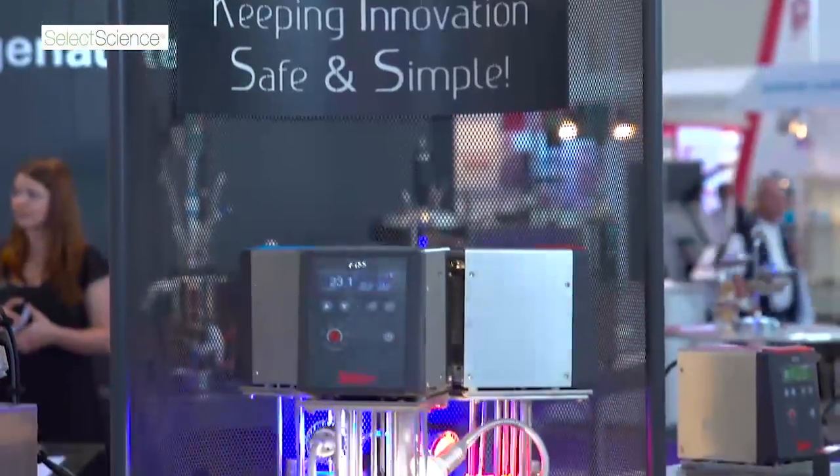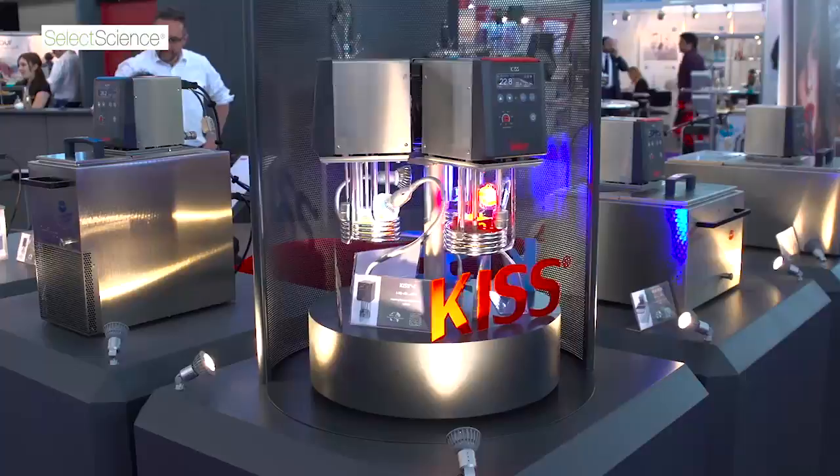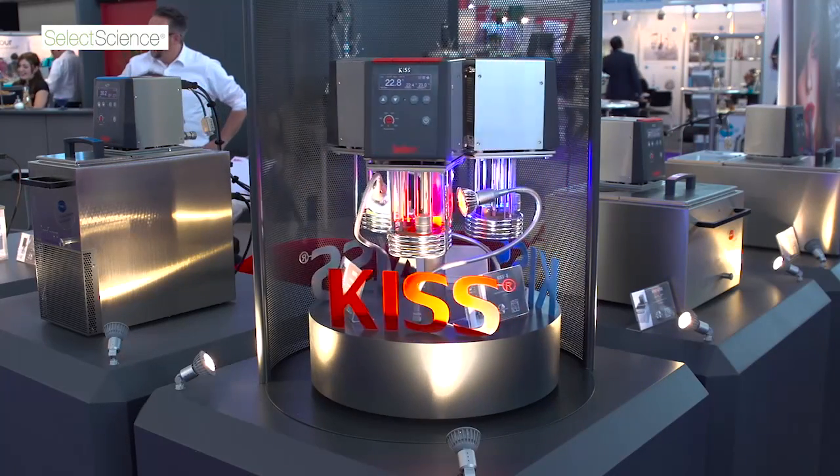The KISS circulators also intend to bring a splash of colour into the lab. The colours — red, black and blue — have absolutely no bearing on the temperature range of the unit. The KISS range is aimed at simple benchtop applications over a temperature range of minus 30 to 250 degrees centigrade. Of course, depending on the temperature range will dictate the unit and the kind of thermal fluid that's used.